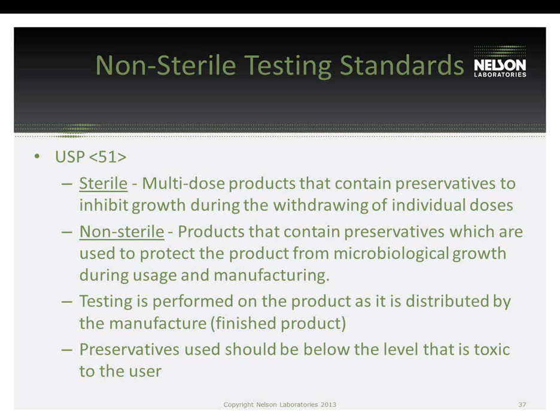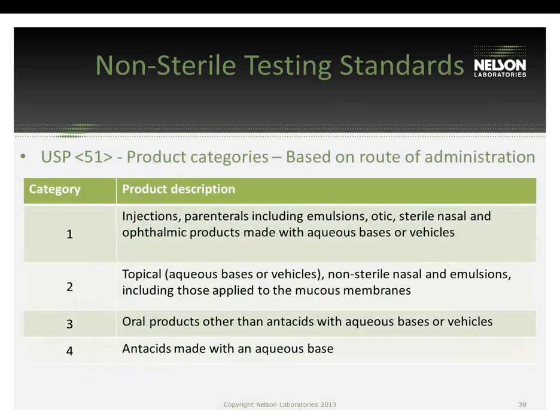The testing is performed on products as it's distributed by the manufacturer. And preservatives in the samples should only be at a level that's not toxic to the user. Preservatives are naturally toxic. That's how they don't allow organisms to grow. So you don't want to put so much in there that it could actually affect the person using it.